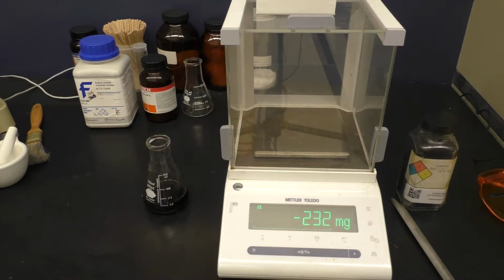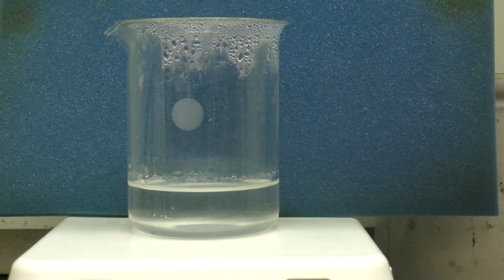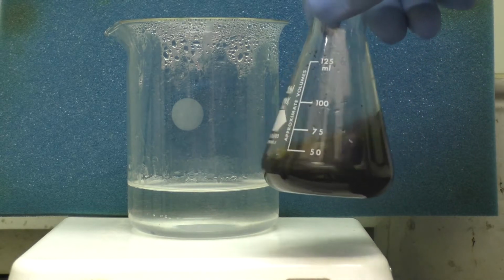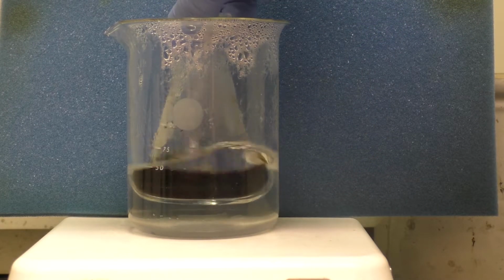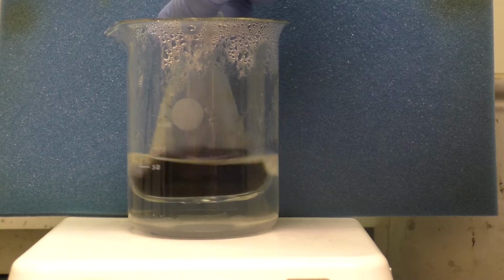We'll now take this to the hood and place this in a hot water bath just to help the decolorization process. We have a hot water bath here in the hood, and we'll place the solution containing the charcoal into that hot water bath. We just let it sit and swirl on and off for about 15 minutes.